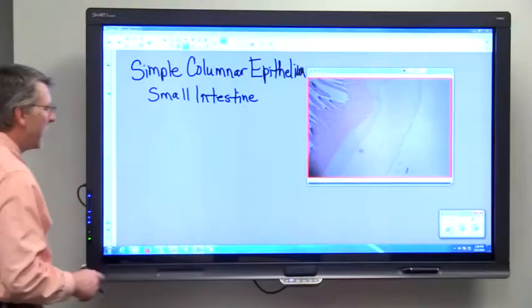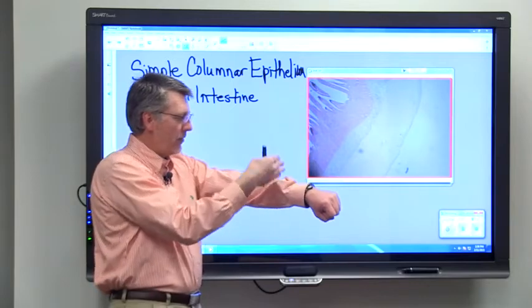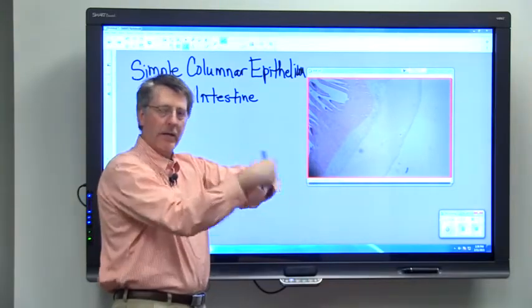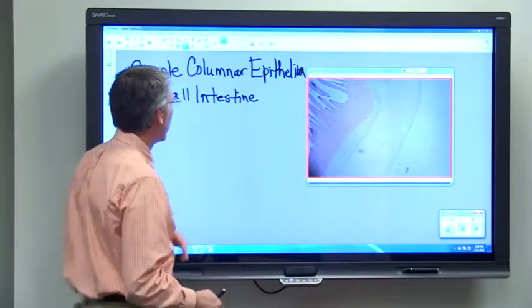I'm just going to scroll around so you can see that it's a circular structure when we look at it in cross section. If you think about having a tube that's hollow, like my arm or a hollow tube, if we cut it crossways and looked at it right at the end, we would see a circle. That's what we're seeing here.